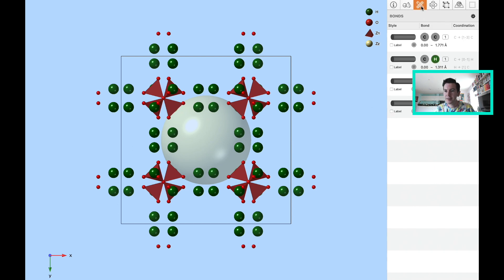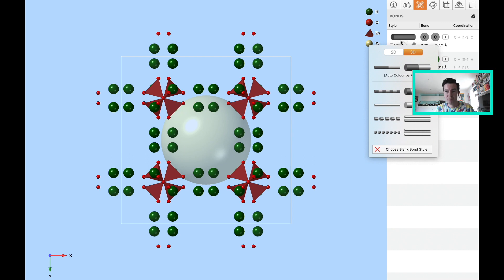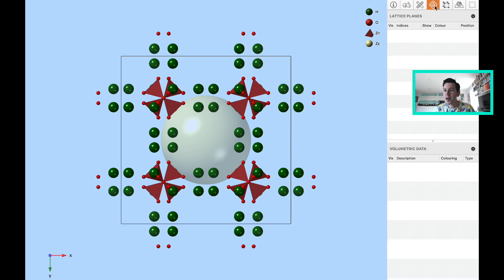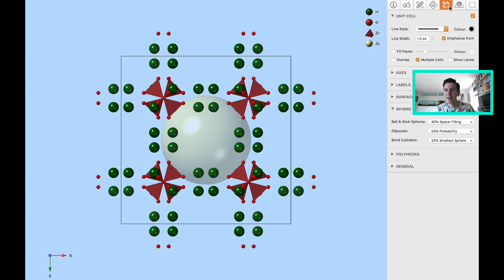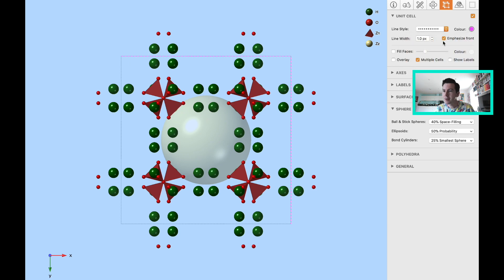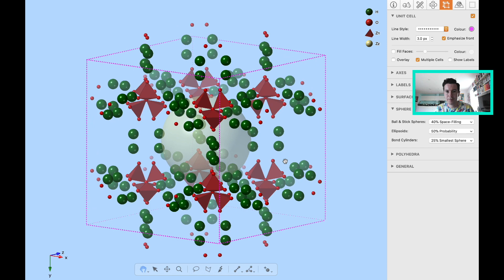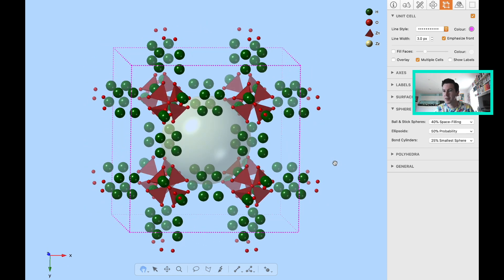The third tab tells me about bonds. Maybe I want a particular type of bond representation — dots instead of cylinders, for example. The fourth tab we'll cover when we get to lattice planes in a couple of lectures. And here we have the unit cell representation. The unit cell is represented as a solid black line, but maybe I want it dotted, pink, and much larger. If I go to rotate, we can see the unit cell represented by the dotted pink lines.